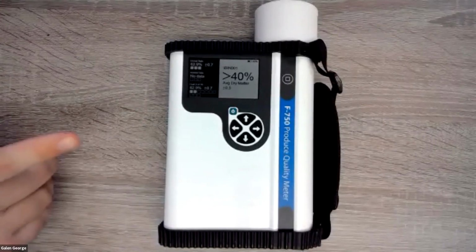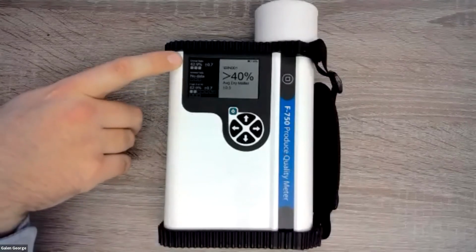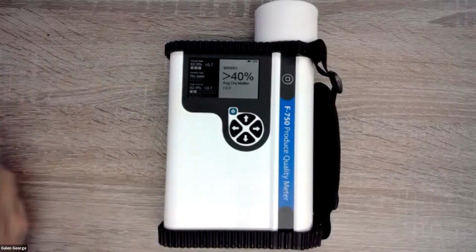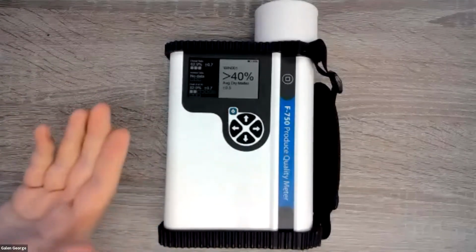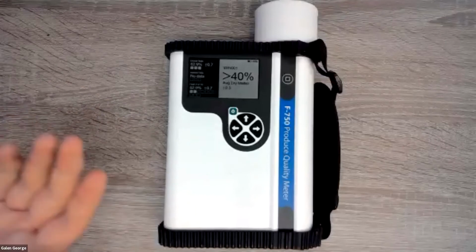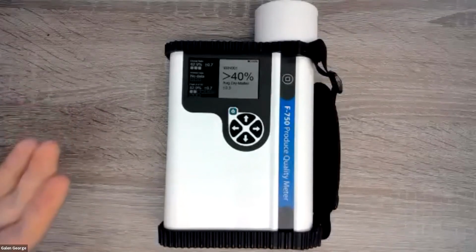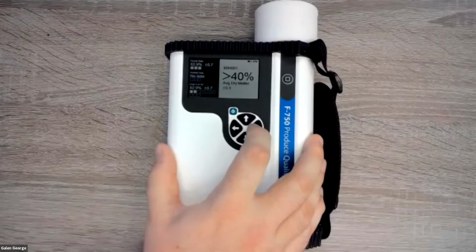Now we have 2 blocks filled in, which means our second fruit is in process. We have the 3 blocks for the dorsal side, and no data yet for the ventral side. Obviously, this is scanning super high. It's a Teflon block, and it's saying the dry matter is in the 60-some% range. That makes sense, because it's not an avocado, so it doesn't know how to handle these spectra being thrown at it. But this is the main measurement screen.